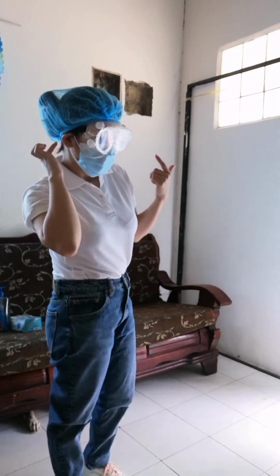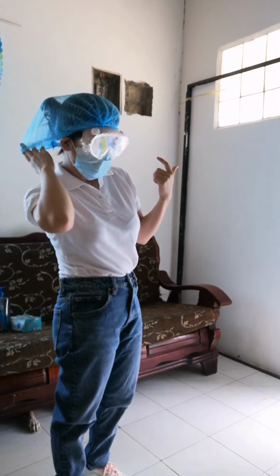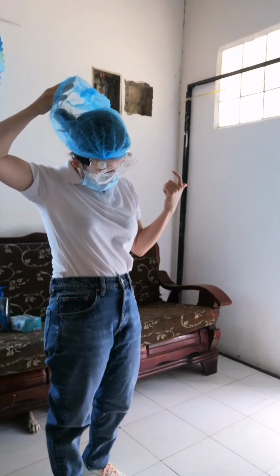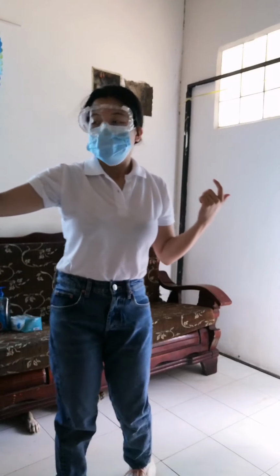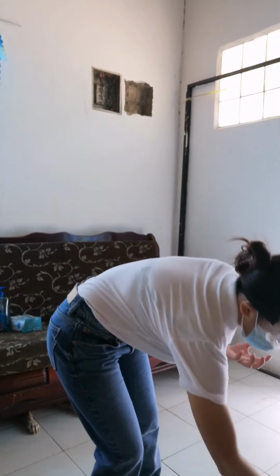Next is to doff our bonnet. This is removed from the inner back to the front. Make sure not to touch the outside layer of the bonnet. This is mainly not to touch or contaminate the face, since our face is more sensitive.